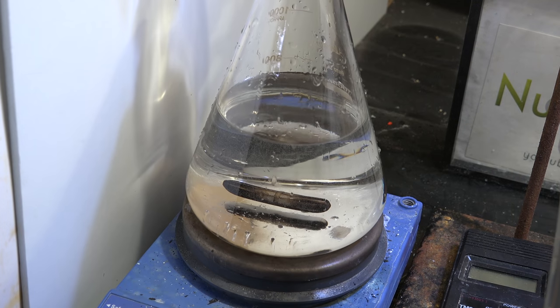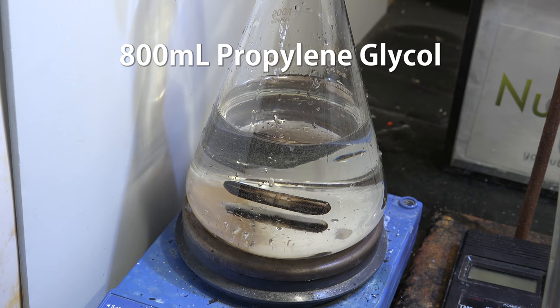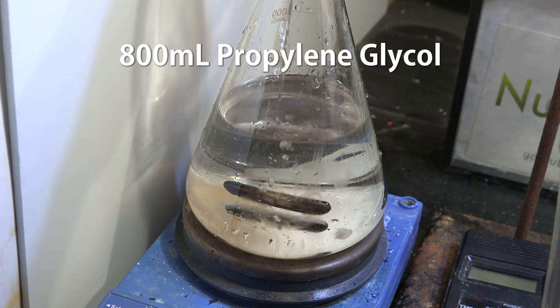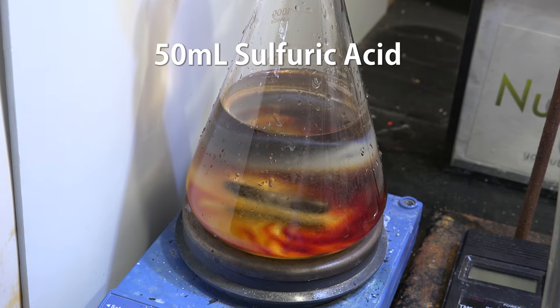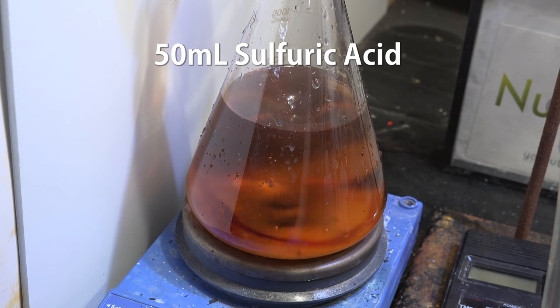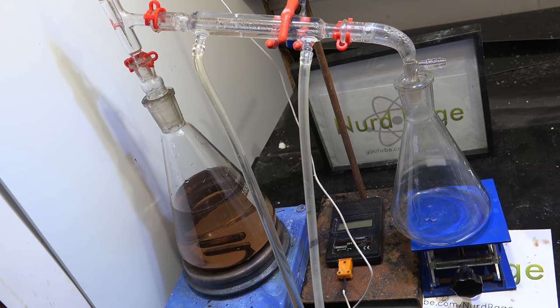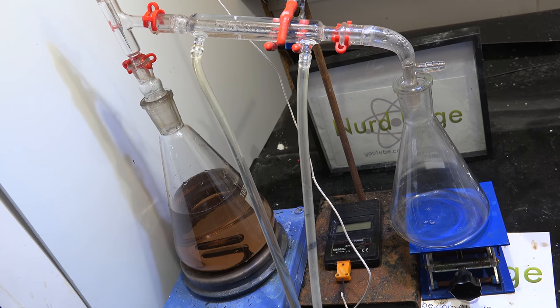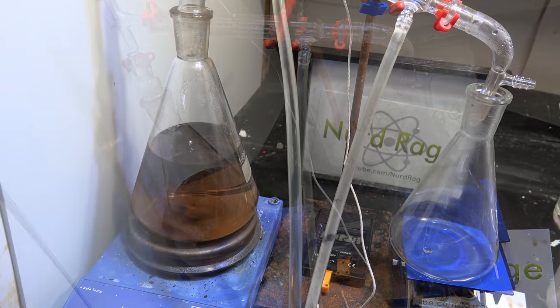Anyway, to make our dimethyl dioxane we get 800 mL of our propylene glycol and add to it 50 mL of concentrated sulfuric acid. I'm using low grade drain cleaner acid. Then we simply set up for distillation and slowly turn up the heating until the reaction starts and we start distilling.